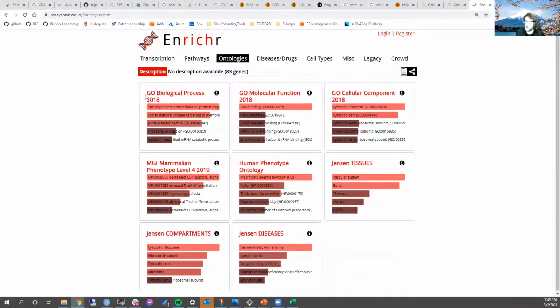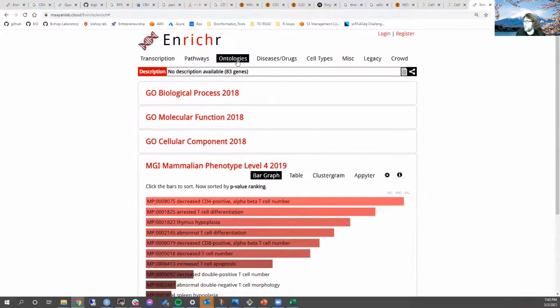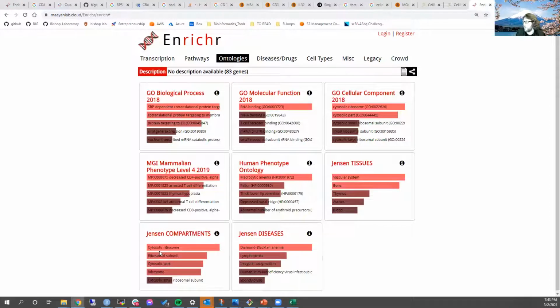Now, ontologies, GO is an example of an ontology, are structured. So it's not just a pathway. You actually have how pathways relate to each other, which has benefits. I don't usually use the hierarchy when I'm looking at it like this, though. So we actually see CD4 T cells. So again, more validation that this is what we're enriching for and that this is correct. See more ribosome, protein, ribosome stuff. So yeah, pretty strong ribosomal signal.